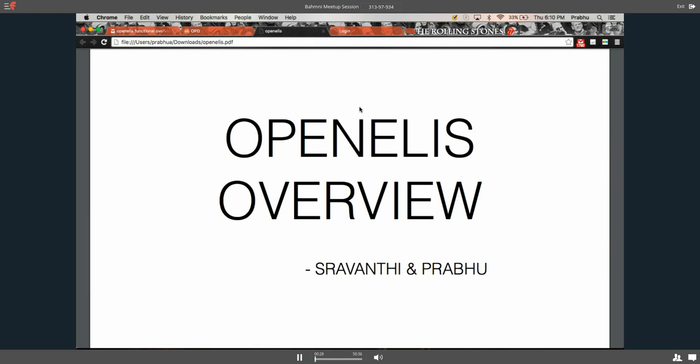Since you've heard about Bahmni, you must know that OpenELIS is one of the three founding open source tools on the basis of which we have completed our EMR functionality. Just to give you a brief overview, OpenELIS is a lab information system. It stands for Electronic Lab Information System, and it is open source. Let's get right into it.